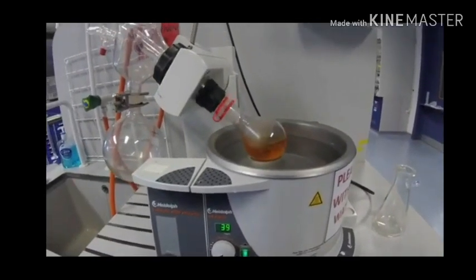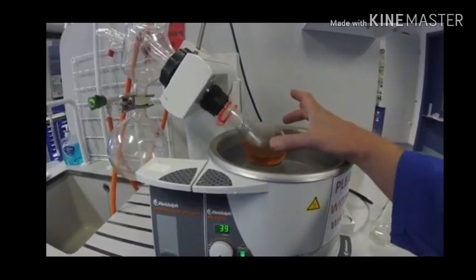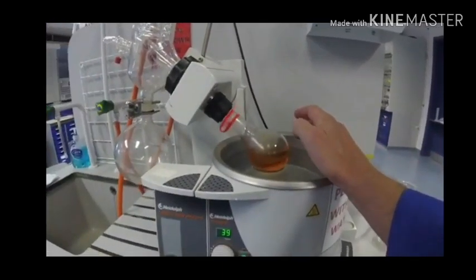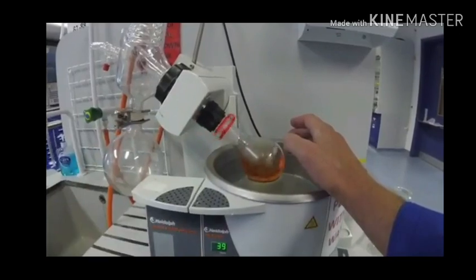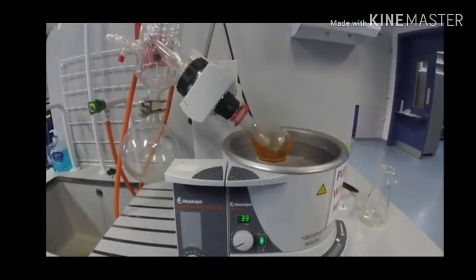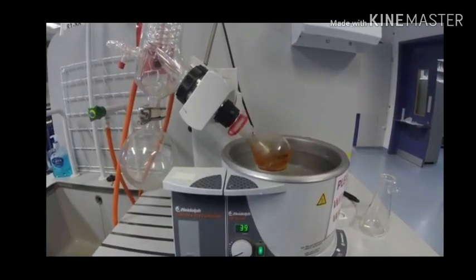The reason why we're rotating the flask is to ensure that it increases the surface area as the solvent's rotated and flung out by centrifugal force around the sides of the flask. And it also means that as it's evaporating, it also stops it from boiling and bumping. And that's when essentially it jumps from this side over to here because the vacuum's built up and the solvent explosively evaporates very quickly. So we're going to leave that to evaporate nicely. It's there, evaporating away.